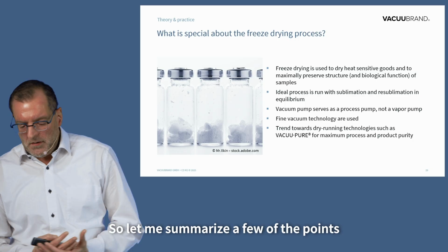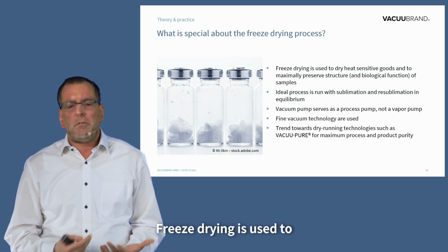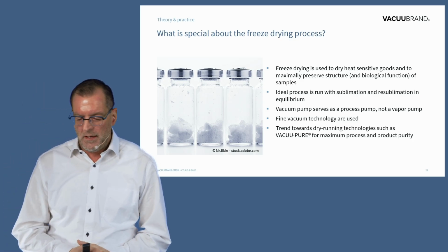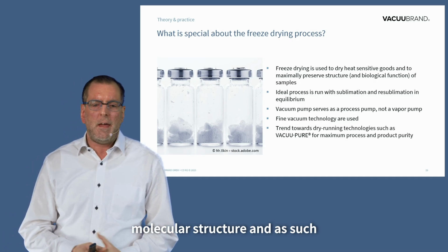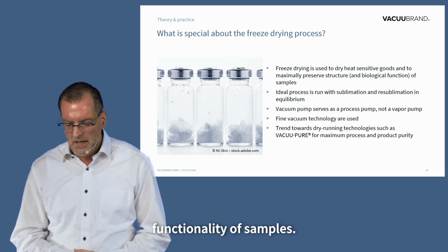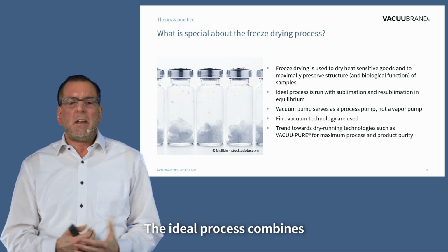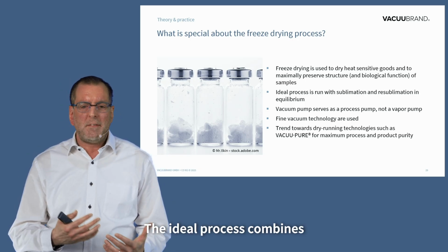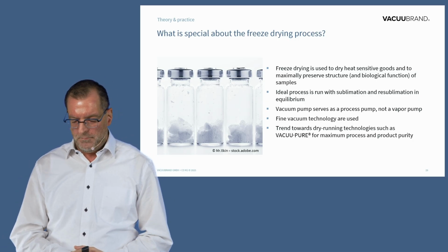So let me summarize a few of the points that we have looked through. Freeze drying is used to dry heat-sensitive goods and to preserve molecular structure and, as such, the pharmacological functionality of samples. The ideal process combines sublimation and resublimation in absolute equilibrium.